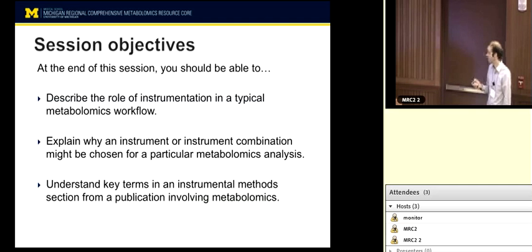Okay, so we'll start just with a brief mention of NMR to sort of segue into Kathleen Stringer's talk later in the symposium. So NMR is a near universal detector. That's a great thing about NMR. NMR stands for nuclear magnetic resonance. It's analogous, you may remember it if you ever had organic chemistry. You put it in the big metal instruments. It's like a cryogenic flask with a probe, and you lower your tube in, and you get a spectrum out, and that's good for identifying your molecule.